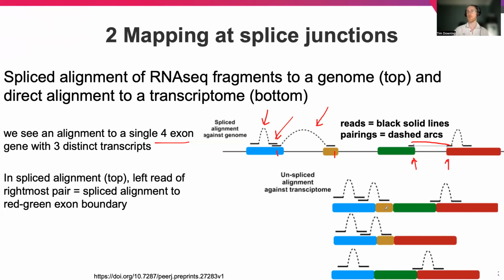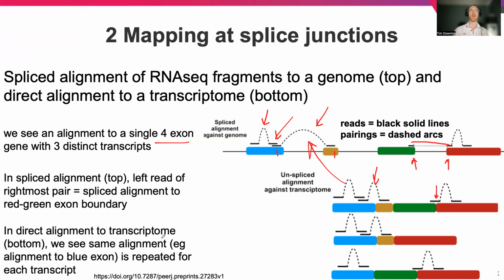It has the introns above it excised, but you consider the insert sizes now will be quite different compared to those above. And we consider for this read here that is mapping over this boundary, how it might map. So with direct alignment to the transcriptome, we'll see that there's no such boundary present, and it should map perfectly across this junction with no additional gaps. So there's 2 slightly different approaches in essence here, mapping to a reference genome and to a reference transcriptome.